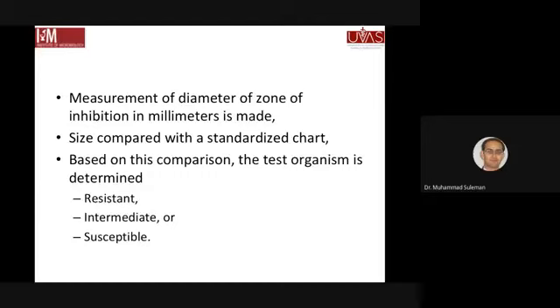जिस पर लिखा होता है कि अगर एम्पेसिलिन है और वो एक ख़ास 10 मिलीमीटर से कम जोन ऑफ इनहिबिशन कर रही है, which means the bacteria is resistant. अगर वो 10 मिलीमीटर से ऊपर जोन ऑफ इनहिबिशन है तो वो ससेप्टेबल है. And comparing the zone of inhibition जो आपको मिला है with the international standard, you can tell that the test organism is resistant to that antibiotic, is intermediately susceptible और ससेप्टेबल.